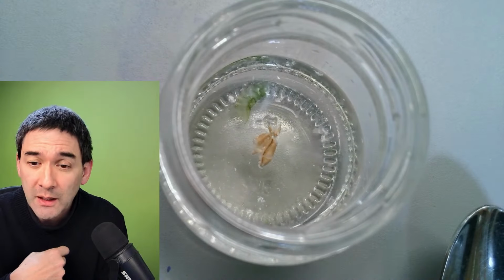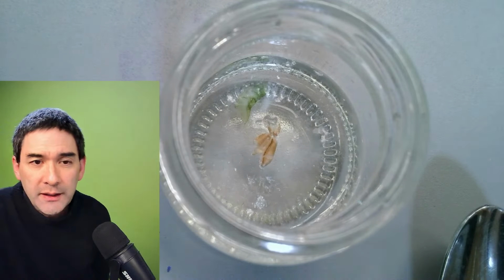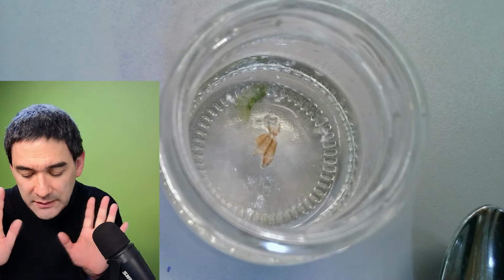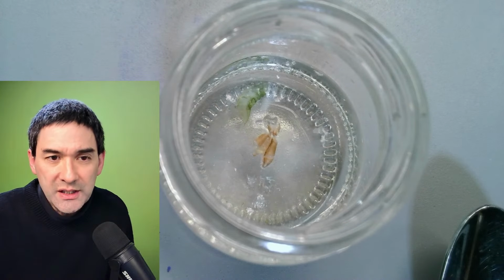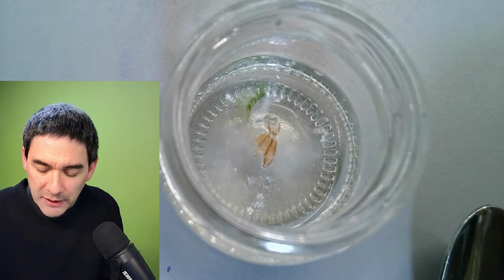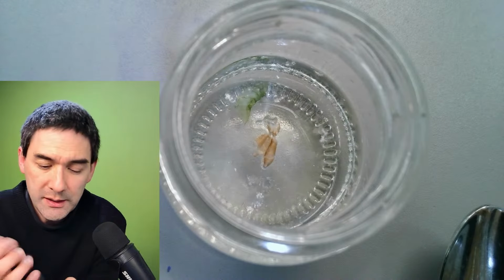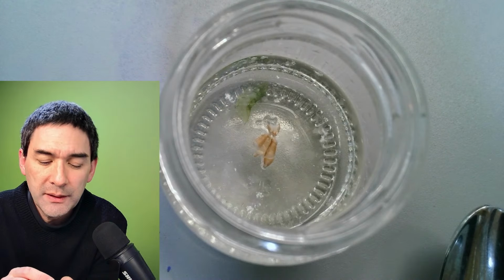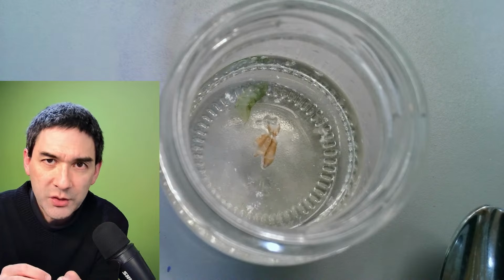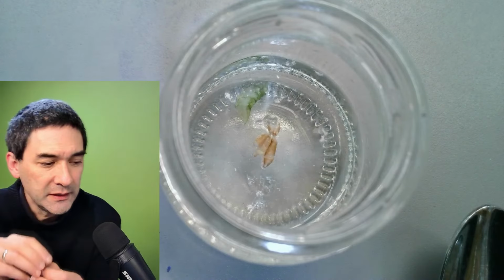Yeah, I tried it with a rice grain, and it did not work quite as well. The reason, I don't know why, but I think, again, I'm guessing, is that in the seed coat, in the brown seed coat, there might be some nutrients present as well, or it's like this, that a rice grain tends to fall apart, right? But the seed coat kind of keeps everything a little bit together.